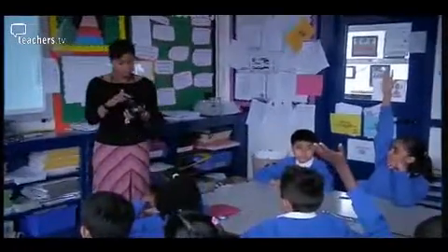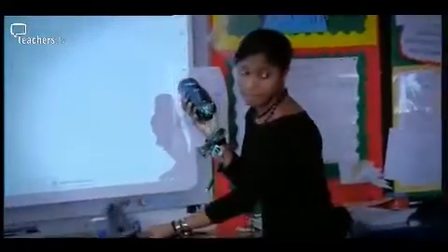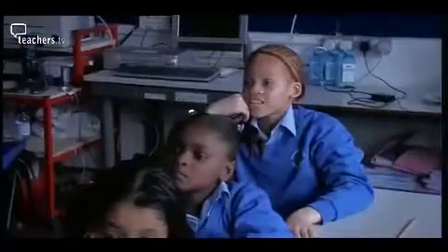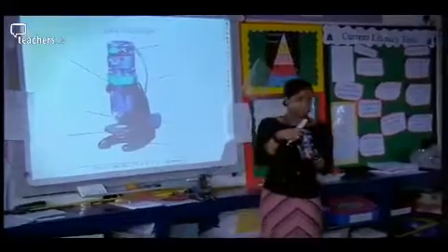So how will Avril get on? She starts the first of the 2 lessons by talking the class through the digital microscope's capabilities. So this is our microscope, and it's got a lot of features on that I found out about, so I'm going to be telling you all about those features. A button right at the top, this one here is in blue.